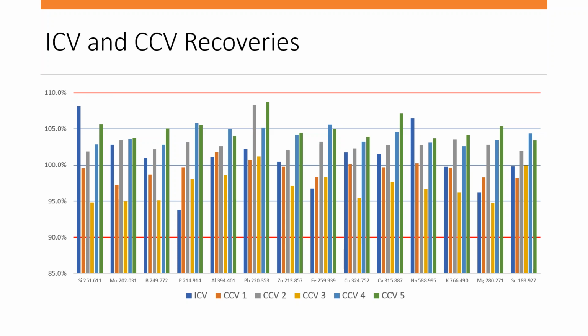And the ICV there in blue, all the recoveries are within 10%. Most of them are easily within 5%. And then the CCVs were prepared by the SimPrep from the same source at half the concentration of the highest cal standard. So the figures can be seen here, and recoveries across the entire analysis were all within that 10%.